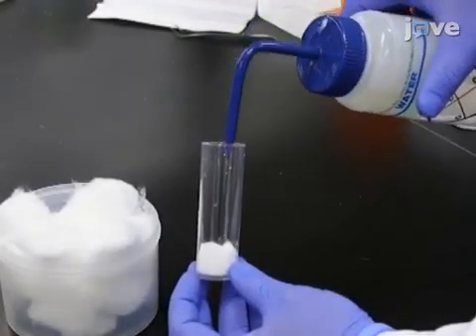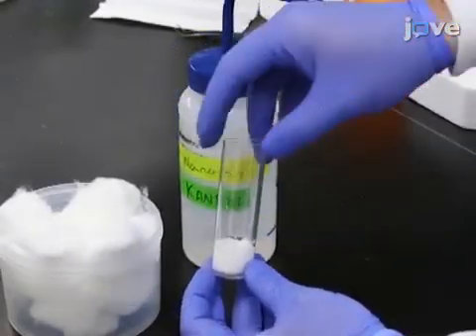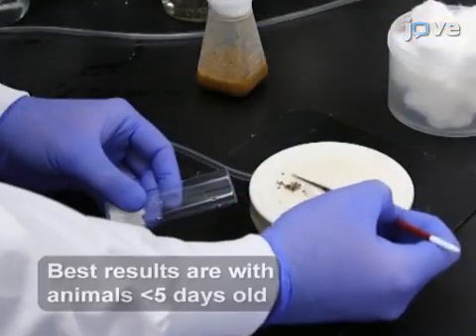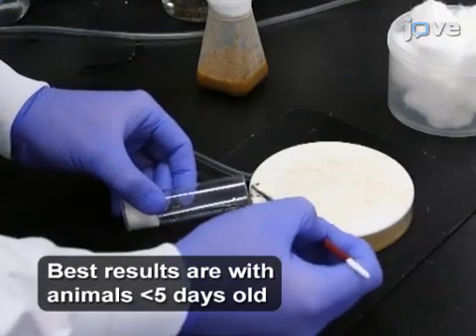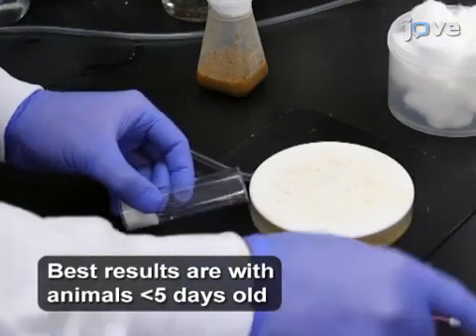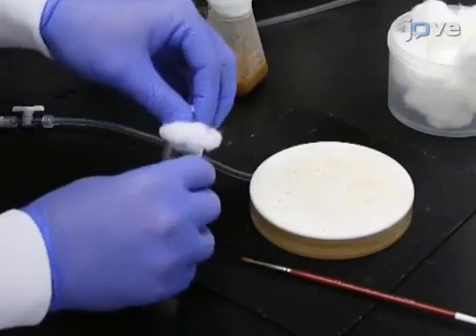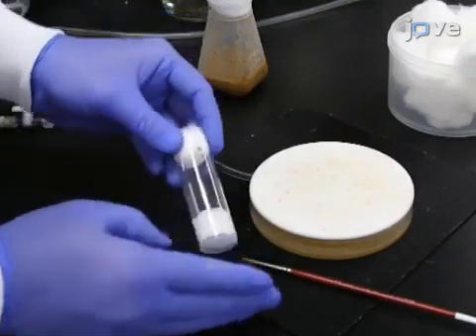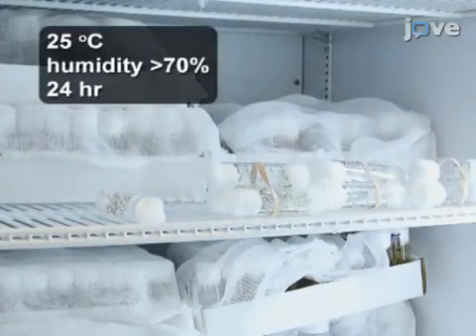To begin the experiment, saturate a cotton ball with water at the bottom of a standard fly vial. Next, collect flies in sets of 100 animals on a CO2 pad and then add the flies to a prepared vial. Use a cotton ball to secure the vials closed. Then, place the vials on their side in an environmentally controlled incubator.